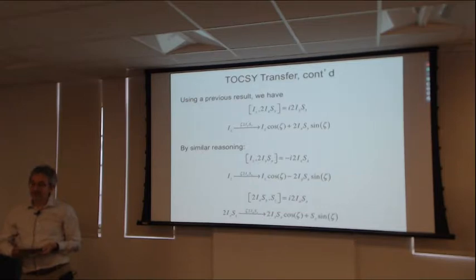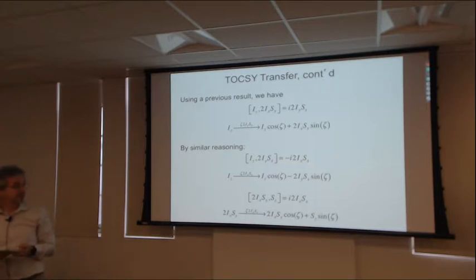But somewhere between our simple approach, short pulses, which is usually called the product operator approach or product operator formalism, and doing purely numerical calculations, we might hope we can learn something, but there may be methods in between those two limits. So the first case I'll talk about a bit is TOCSY transfer.